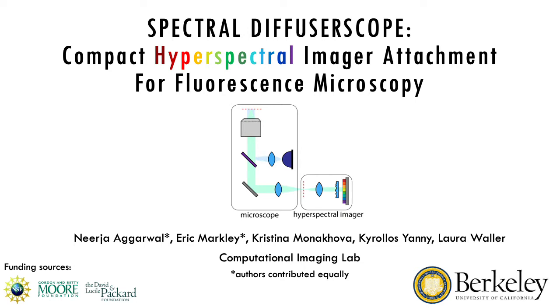Today, I am going to present Spectral Diffuser Scope, a novel, compact hyperspectral imager we adapted for fluorescence microscopy. This work was in collaboration with my co-author Eric Markley and inspired by the proof of concept for photography developed by Kristina Monakhova and Kyrollos Yanny.